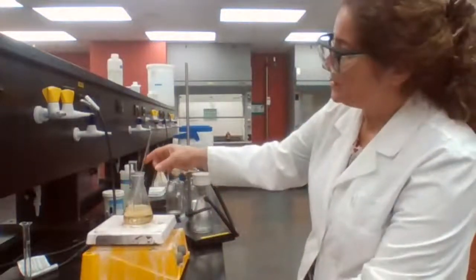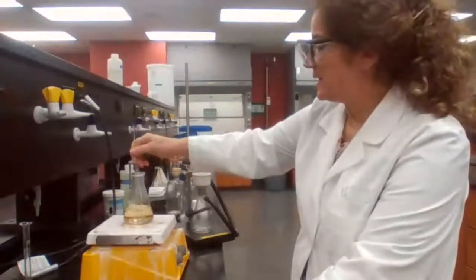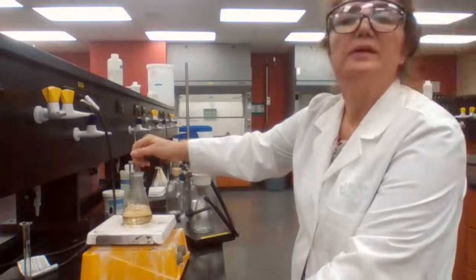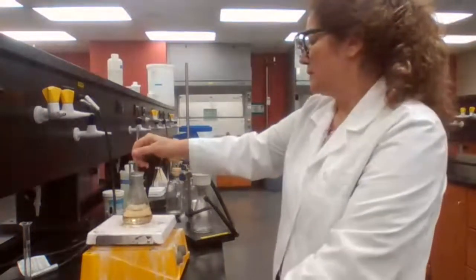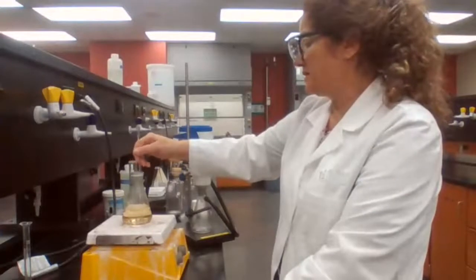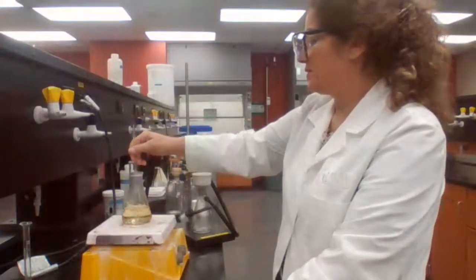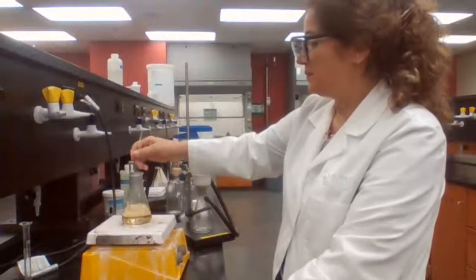Okay, do you see the sample being dissolved? Could you see that there is no white powder in there? Yes? Okay. So the sample is dissolved. Just have a very tiny piece of oil particle, and make sure that it's gone.